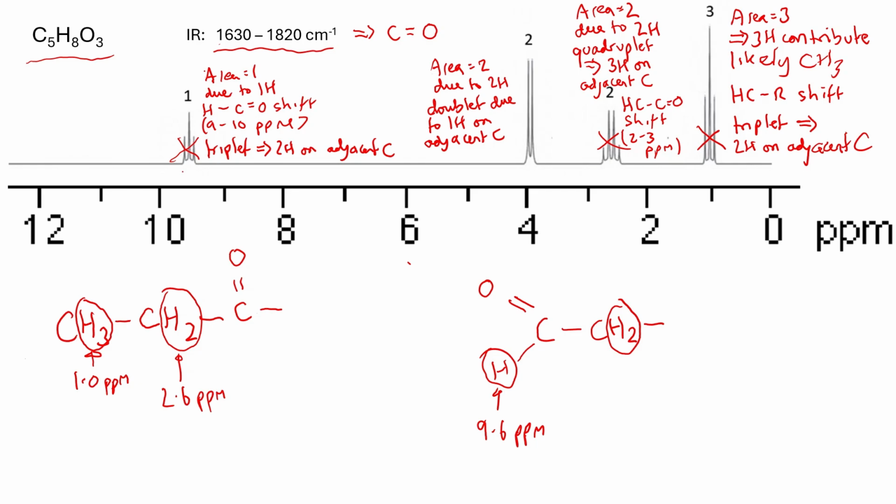The first would be that it wouldn't fit the molecular formula, because although we've then accounted for all of the carbons and all of the hydrogens, we haven't got all of those oxygens accounted for. So we've got a missing oxygen, but also the chemical shift of this around 4 ppm isn't consistent with just being next to carbonyl groups, because it's next to a carbonyl on that side, but it would also be next to a carbonyl here, and that wouldn't account for a shift of 4 ppm.